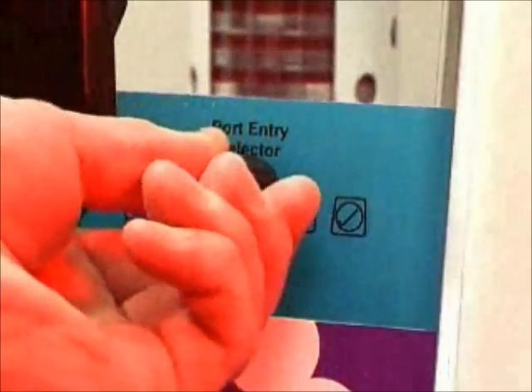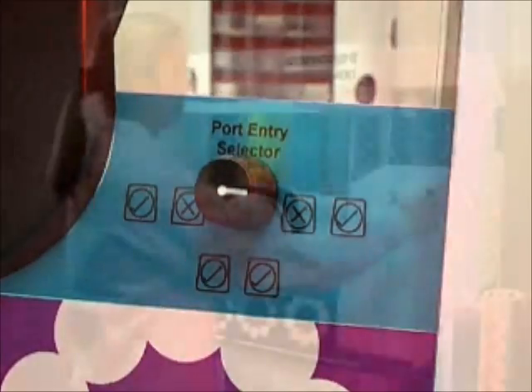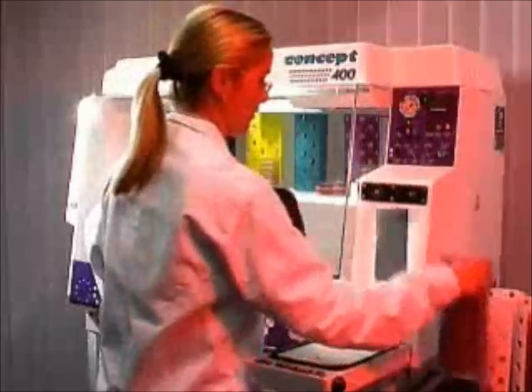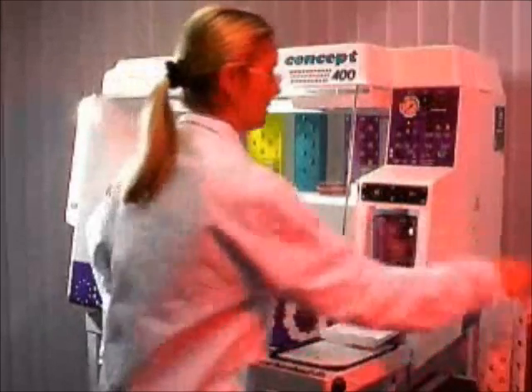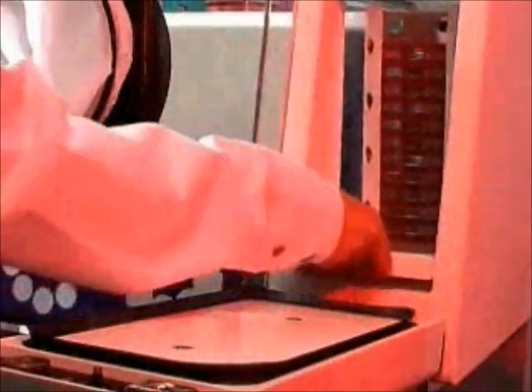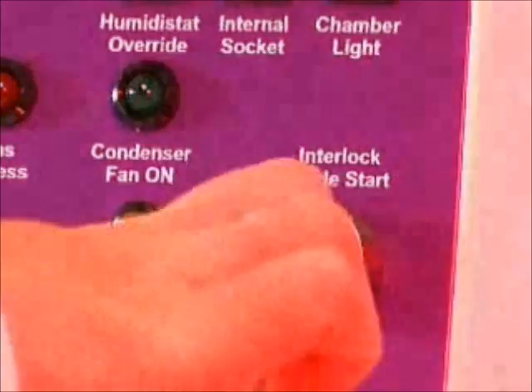To operate the Ruskin Concept 400 Rapid Interlock, begin by turning the port selector switch to activate only the right sleeve. Enter the right side port with your left hand as described in the Easy Sleeve video. With your right hand, load your media into the interlock using our convenient petri tube holders and taking advantage of the accessible pull-out shelf.